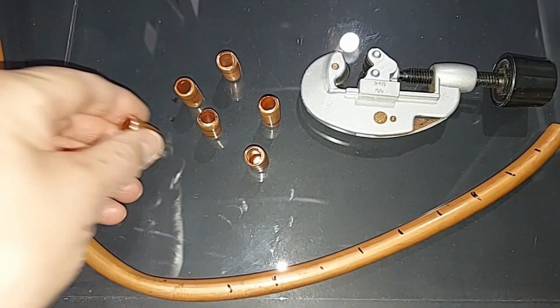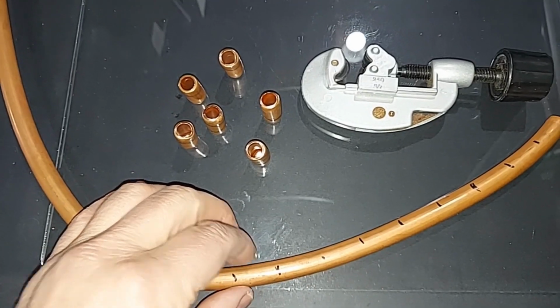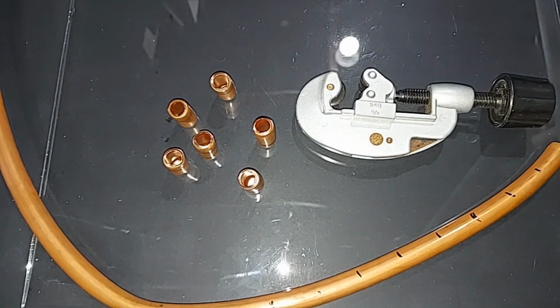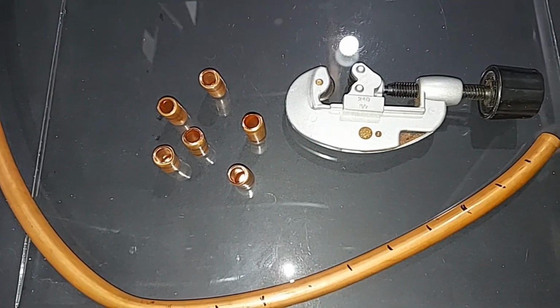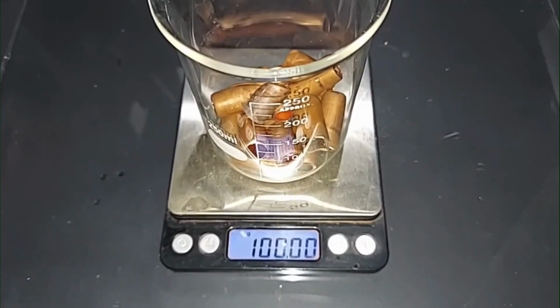Each one of these weighs about 6 grams here. And I could just put in a whole piece of tubing, but the extra surface area we'll gain by cutting them into smaller pieces will help them dissolve when it's time. I'll need approximately 17 of these in order to get the 100 grams we need, so I'll be back when I'm done with this. Getting these things right on the money is not easy, but here's 100 grams of copper metal pre-weighed.